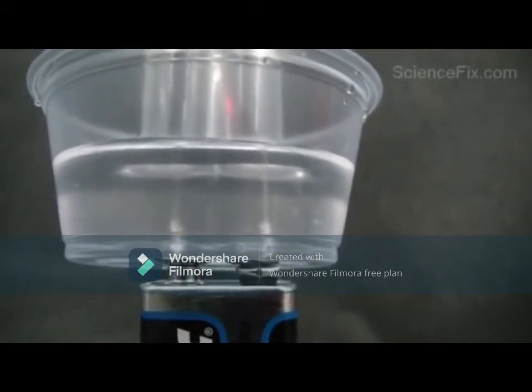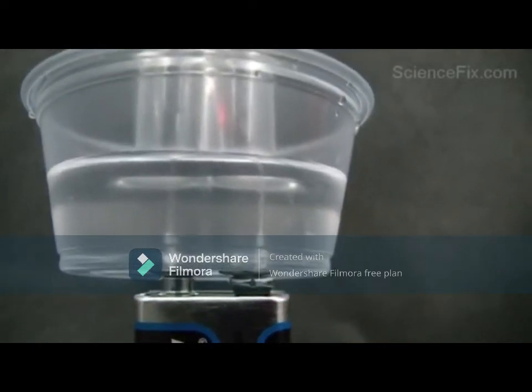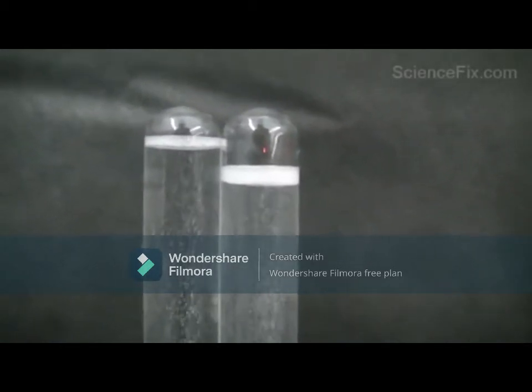So one of the gases will be collected in larger volume. As you can see, there is effervescence at both electrodes. This proves the presence of gases.